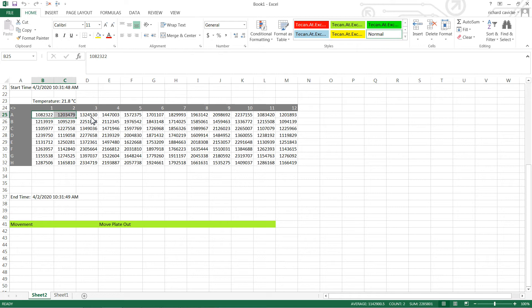By virtue of this attenuation feature, it extends the reader's ability to measure very bright samples by another hundredfold. The reason for this is that the detector is linear up to 10 million counts, but beyond that too many photons are arriving for it to remain linear. By putting the OD filter in front of the light path, you bring the detector into a range where it can accurately detect the signal, and then the hundredfold factor is applied back onto the data.